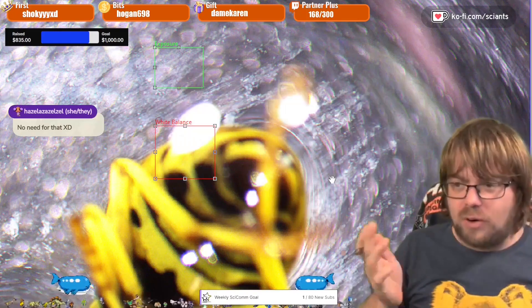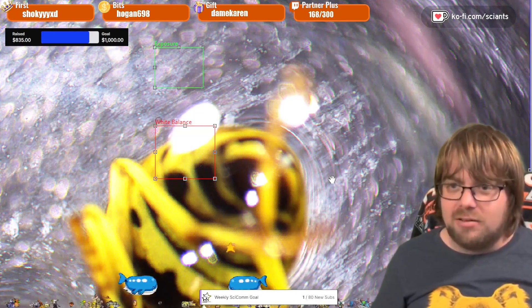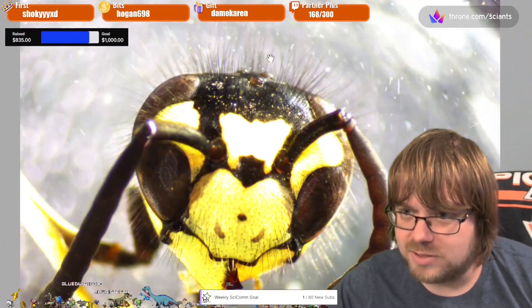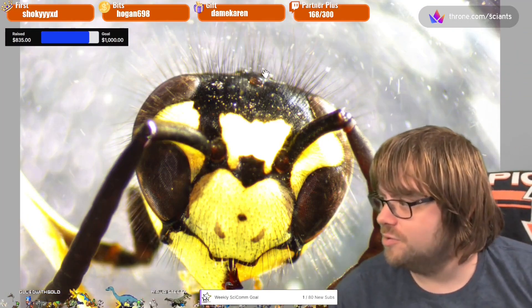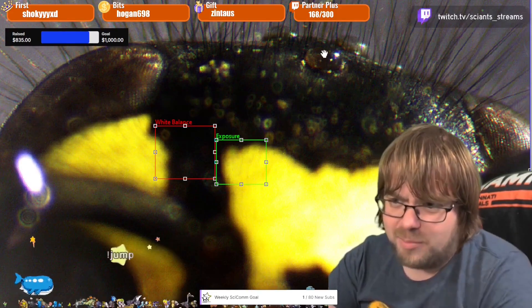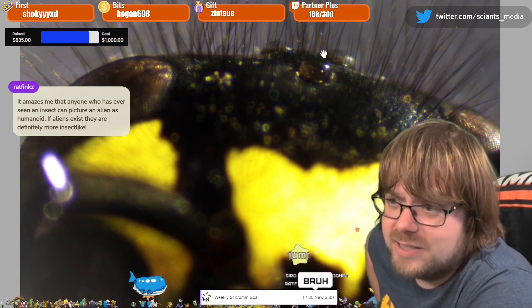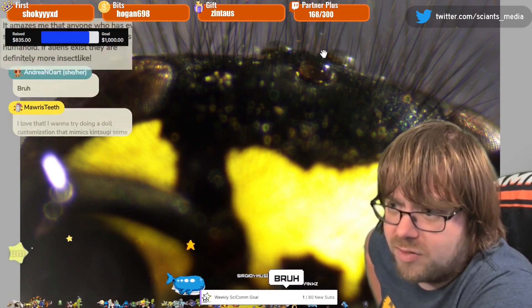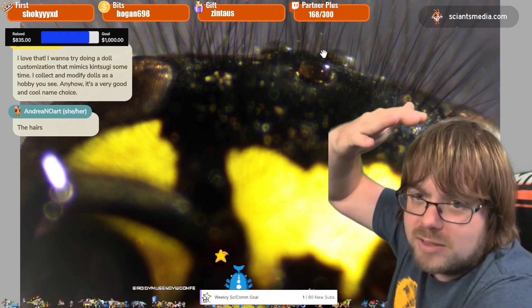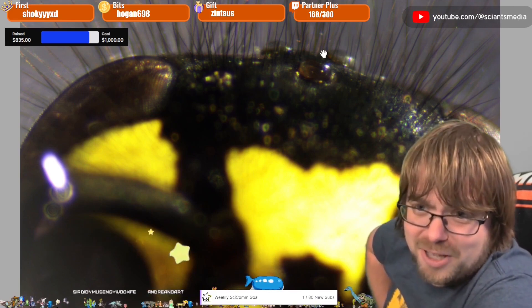We're going to first remove the head - not dissect into it yet, just pop it off. I want to take a look at the ocelli, or those fake eyes. You all see the fake eyes? They're right up here - those three dots, one, two, three. Those are the ocelli, the UV-detecting eye cells. That is a telltale sign of a flying insect. Insects that have a heavy light component to their life cycle will have those three eye cells up top, or some variation - some have just one large one and others have a cluster of three.